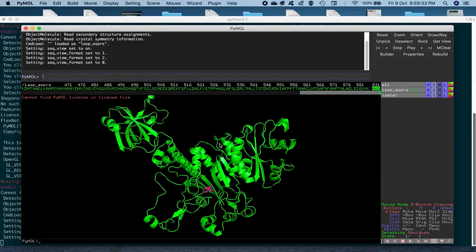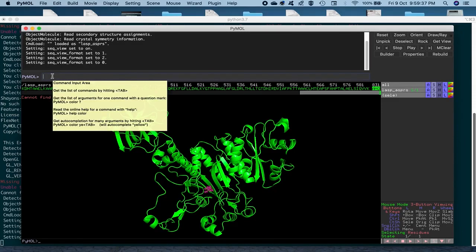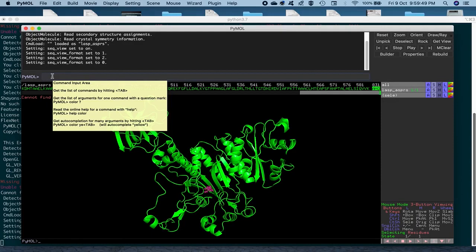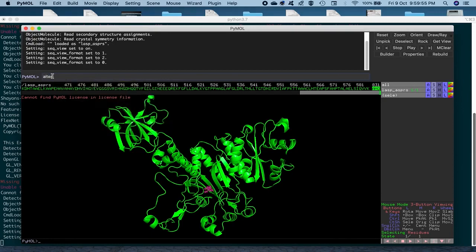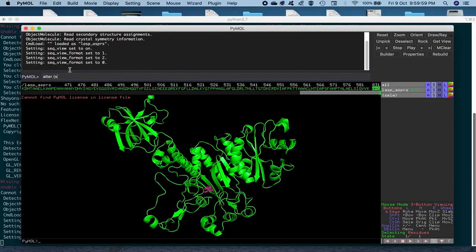So, once we have this AMO selected, we can operate on that by using the selected number of atoms by using the select feature. The command here is, in order to change the residue name or the chain ID, is alter and then space, beginning of a bracket and S-E-L-E, that's the short form for selection.